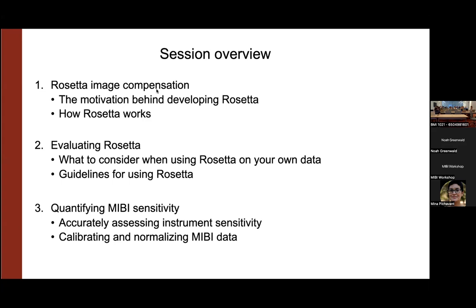Finally, you'll hear from me about the steps we've taken for image normalization and in general, how we have come up with a new way to assess the sensitivity of the MIBI instrument, which we've used in a couple different steps in our pipeline throughout.